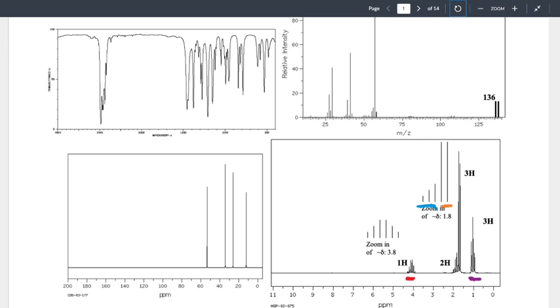CH3. Okay? And you'll note that what I'm introducing now is a hanging bond for that carbon, because that hanging bond means I need something there. I don't know what it is yet, but what I'm trying to call attention to is that there's something missing out there that I need to eventually fill in. Kind of makes sense? It's a little bit bigger. Okay? Is there another interpretation?